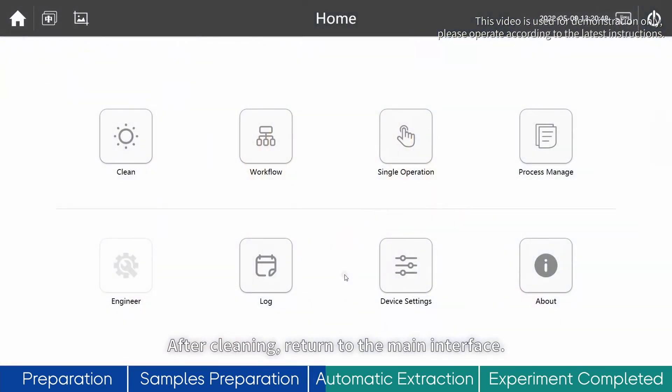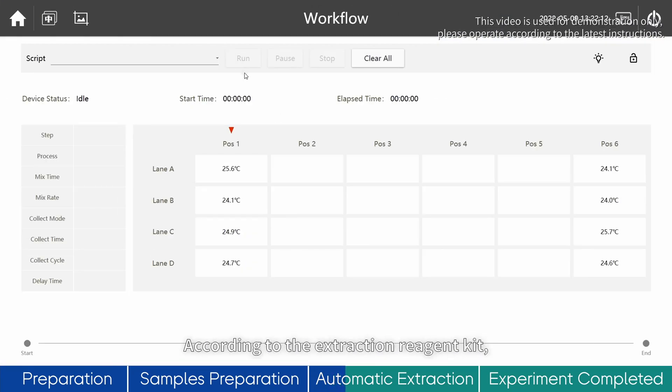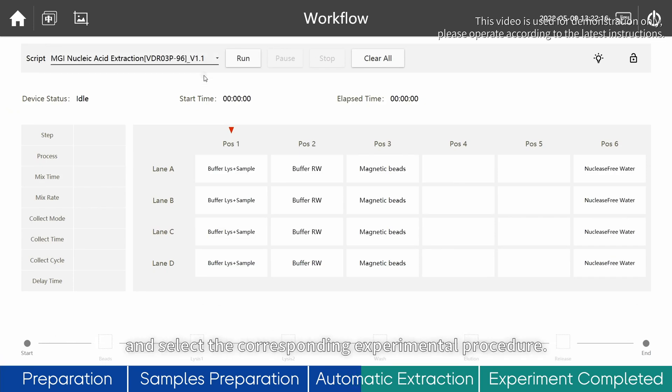Click Running to enter the running interface. According to the extraction reagent kit, click the drop-down box of script and select the corresponding experimental procedure.